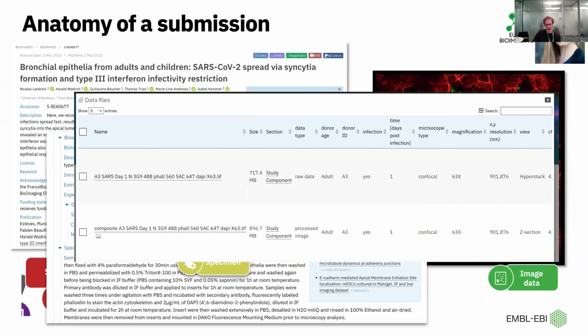And then for each of the images in the study, there's tabular information, which is the information that's relevant at the individual image layer. So for example, if magnification differs across the images, this is the information that will vary from study to study because different things are relevant. In this case, because this is human samples, it's important to know the stage of the donor, for example, but for a compound screen, this would have the links to the chemical compounds.